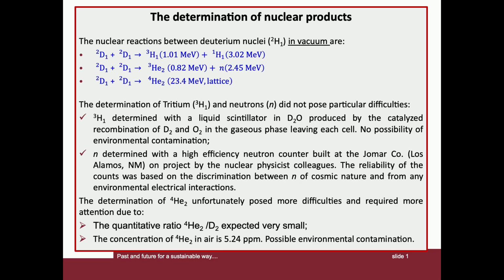Tritium was determined with a liquid scintillator in heavy water produced by the catalyzed recombination of deuterium and oxygen in the gaseous phase, leaving each cell. No possibility of environmental contamination.